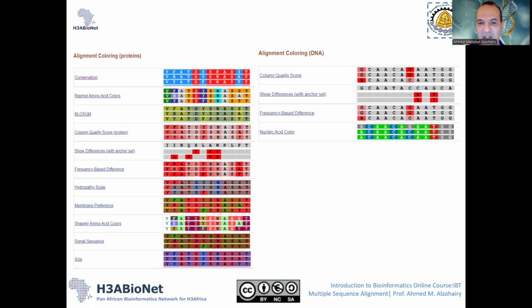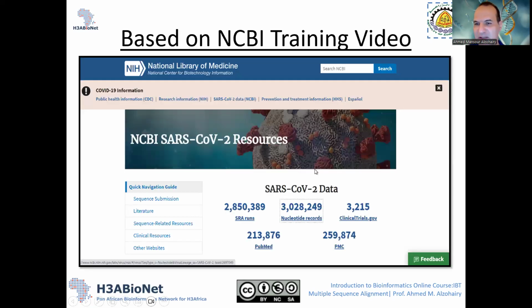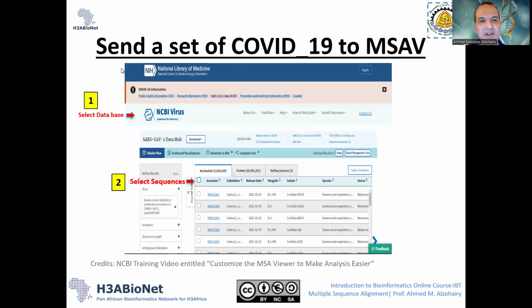as we said in the last lecture. In this lecture, we will pick some of these sequences. As we said, this training is based on the NCBI training video, but we will do the same thing here with this example. You can send a set of COVID-19 sequences to the MSAV.